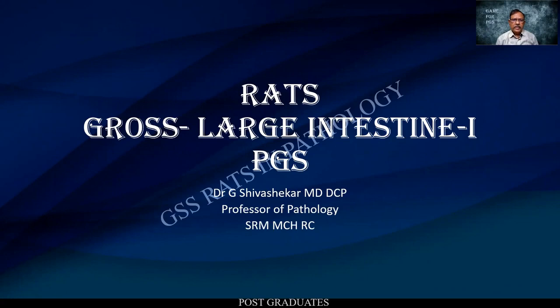At the end of the class, I would like you people to kindly decipher the expansion of the mnemonic GAME. The class for today is gross. In the last class, we had seen the kidney, and now it is the large intestine. I have pertinently divided it into two parts, and this is part one of the large intestine.